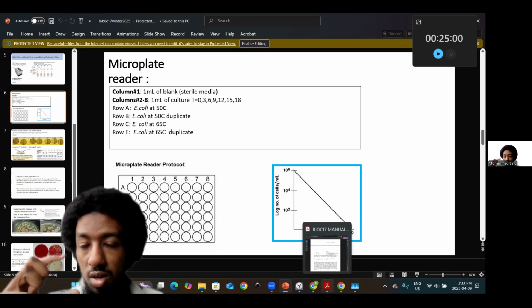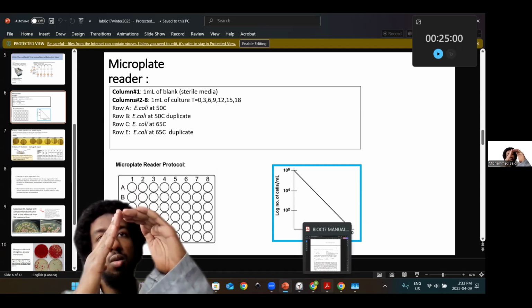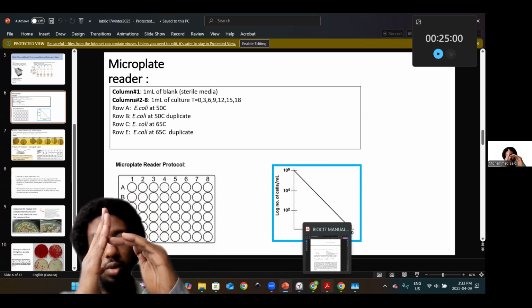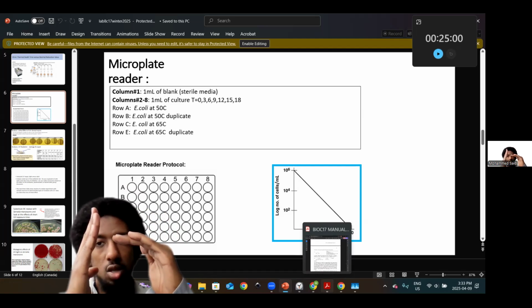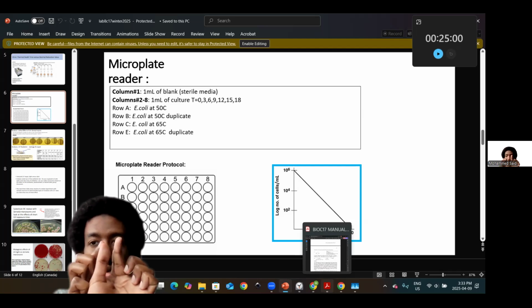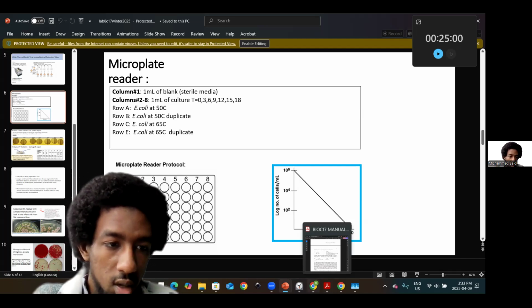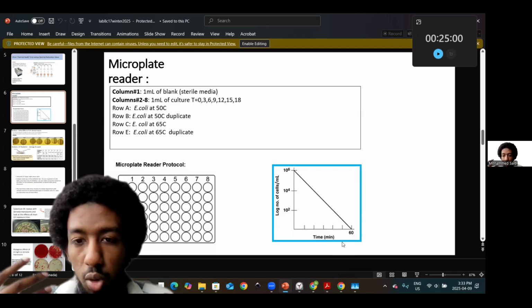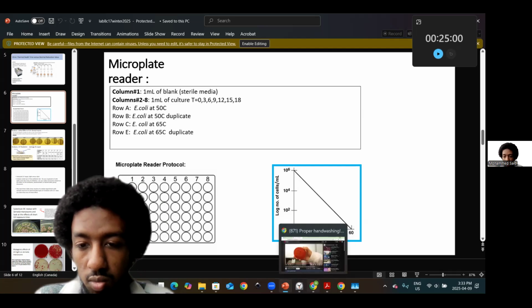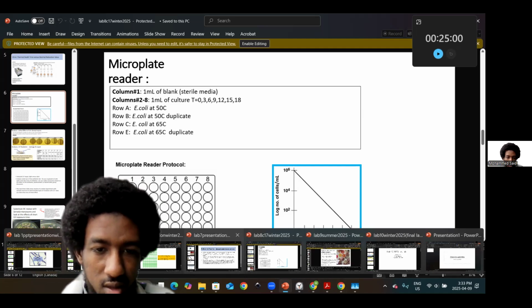The contrast is with the D value. It's a tenfold decrease, so with a steeper slope, even if you go down tenfold on your y-axis, which hasn't changed, the difference in your x-axis is much smaller, right? It's compressed more, and thus that depicts a lower D value as well. So think about how those different components relate, and compare and contrast these results with what you've done from the generation time assignment. I hope that makes sense.